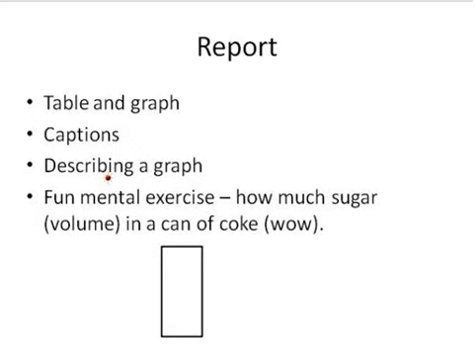You know, obviously linear is a good thing here. If there's scatter in the data, or if some of the data looks a little odd, you should comment on that data. You should say, oh, as we got to higher and higher amounts of added sugar, things appeared to change a little bit, or the point at 5 grams of added sugar looks a little bit different than the rest of the points. So something about the data and what the person should see when they look at the data. And basically what you're telling them is, this is what I see in the data, this is what you should see in the data. So all of those are really good principles to get in the habit of doing, and they will serve you well throughout your college career and writing reports and beyond, hopefully.